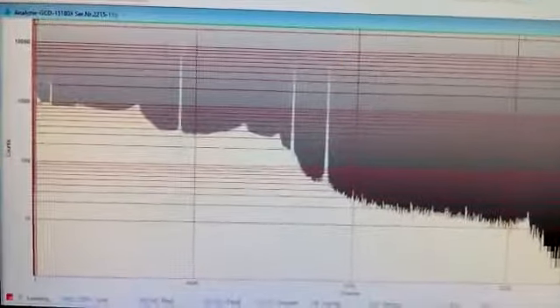Then I will go to the left boundary, all on the far left hand side. It found some kind of an X-ray peak at 13.50 keV, which I don't think is anything except some kind of noise it's picking up. I will click on that, go to peak, and again delete that.